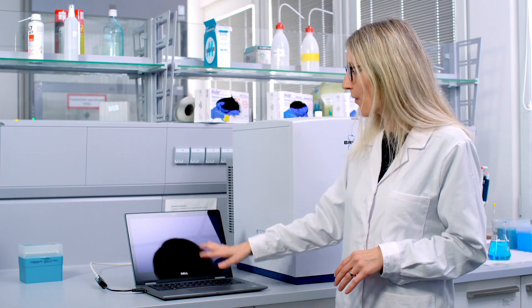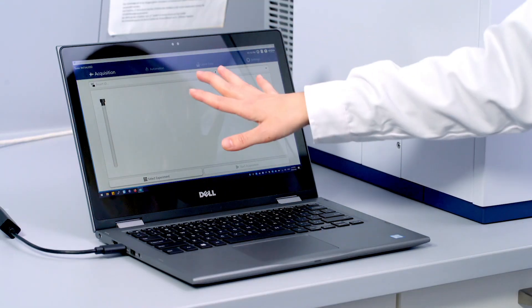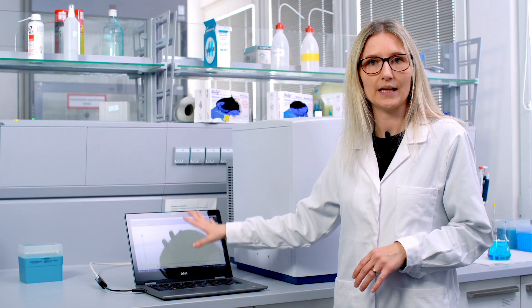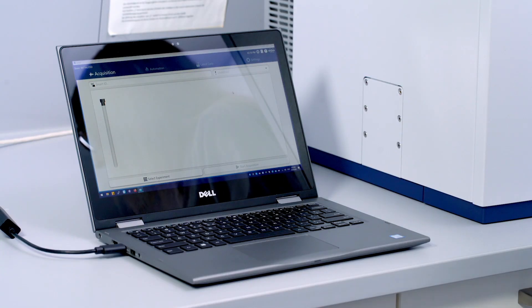You can run them from Topspin or you can even import the experiments into GoScan very easily and you can again hide the experiments behind the buttons. So then not only you have access to NMR but you also allow your not so experienced colleagues to use NMR. And that's it.